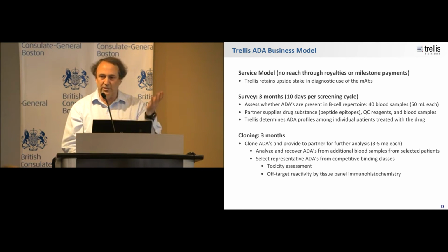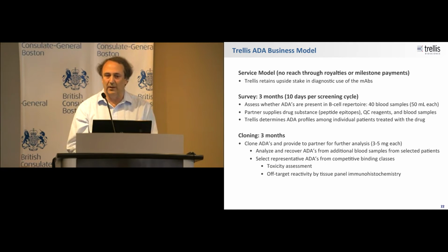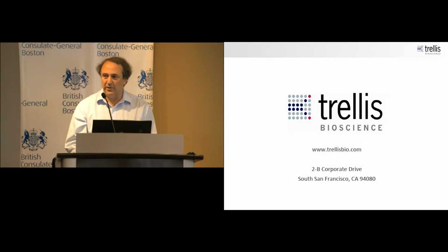Then we'll determine the ADA profiles across the individual patients. If it looks appropriate, we can go back and actually clone the antibodies, generate a few milligrams of each, and deliver that to the partner for toxicity assessment and off-target reactivity. So that's what we do, and that's what we think we can do that would be helpful to people interested in ADAs. Thank you for your attention.